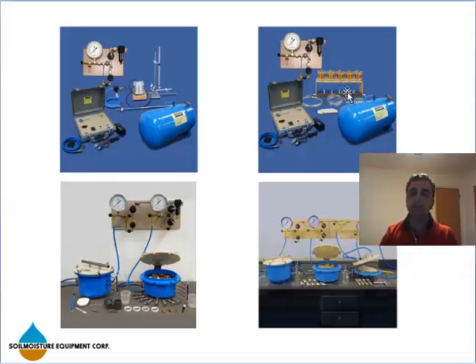Here we have 1425, that is a Tempicell system. Here what we have is 5 Tempicells that are 6 centimeters tall, and can be 6 centimeters or 3 centimeters. We have different options. And the diameter is 2¼ inch. Tempicells are basically miniature extractors, miniature pressure extractors. Instead of using this big guy, you use a tiny one.